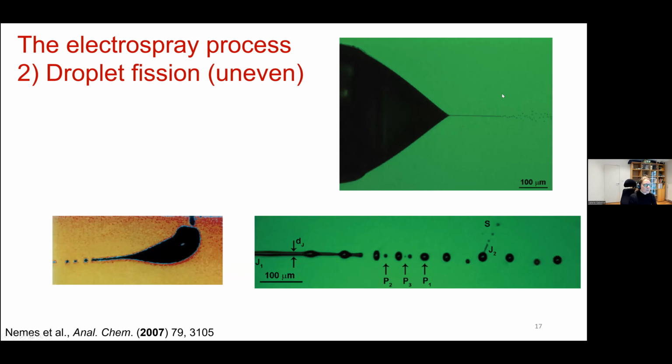Now this is the production. There are some regimes in electrospray where you can produce a very thin beam of very narrow droplets. And that's what happens next, because here the droplets still contain millions of water molecules. So what happens next is that the droplets themselves evaporate, because we still have a lot of gas. It's ambient temperature and ambient pressure.